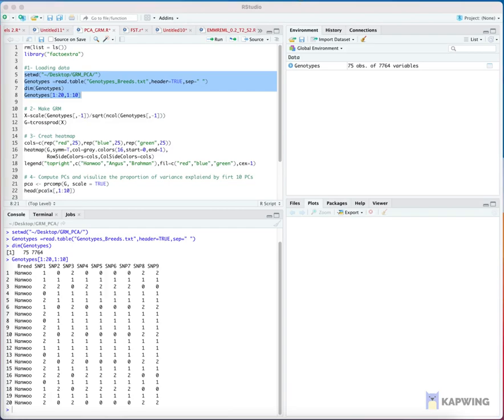Step 3: Compute the simplest form of genomic relationship matrix (GRM). The GRM is the covariance matrix calculated from the SNP information of the individuals, specifically from the minor allele counts.